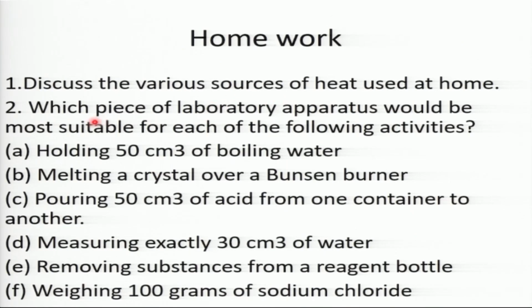Number 2: which piece of laboratory apparatus will be most suitable for each of the following activities? So we have activities here. We have some activities A up to F. All right? So among the apparatus we have studied, which one is suitable for all this? One, holding 50 cubic centimeter of boiling water. What apparatus do you need to use among what you have studied?